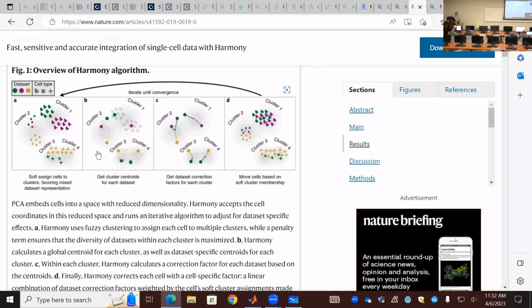So our input for this algorithm is their embedding, okay, their position in the 3D, and their labels. So I know which cell is from batch 1, which cell from batch 2, which cell batch 3. You probably can give the cell type, okay? So there's no big X involved in this algorithm. So no gene expression level or gene name plays any role in here.